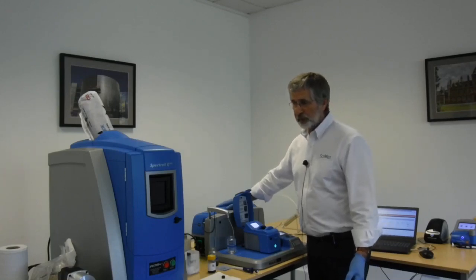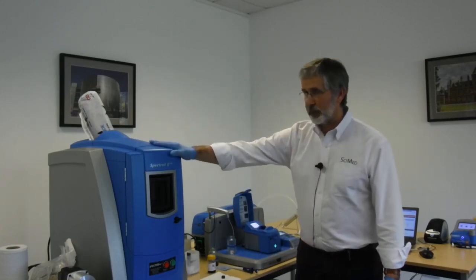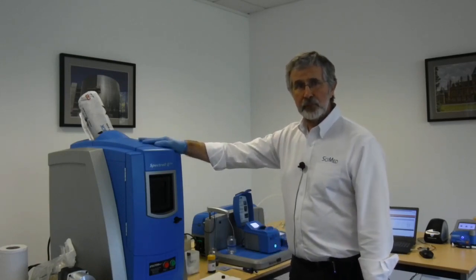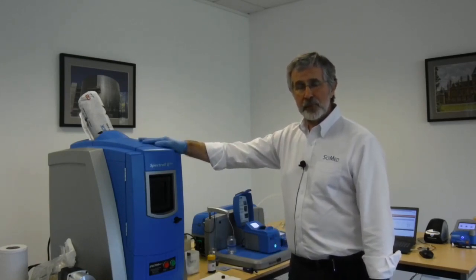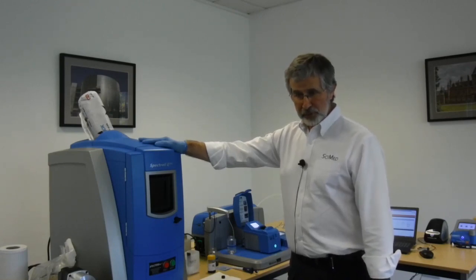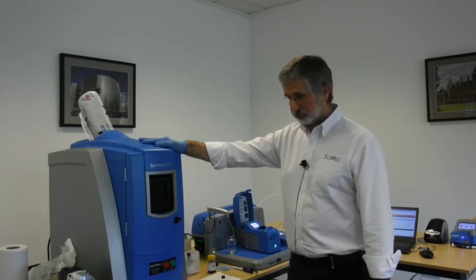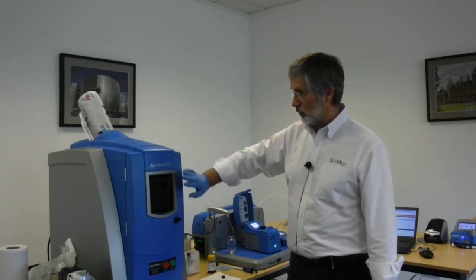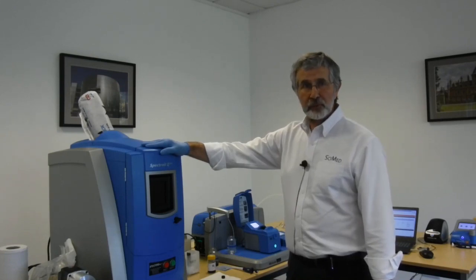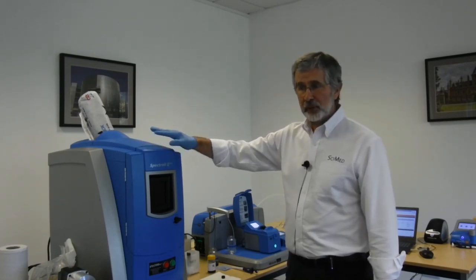The reason for that is that the wear metal spectrometers, and that means all of them, this particular one greater than 10 microns. The commercial oil labs use a technique called ICP. This is called RDE, rotating disc electrode, and they can't see much more than 5 microns. So if you've got big iron particles, your typical wear analysis will not show it, but this will.